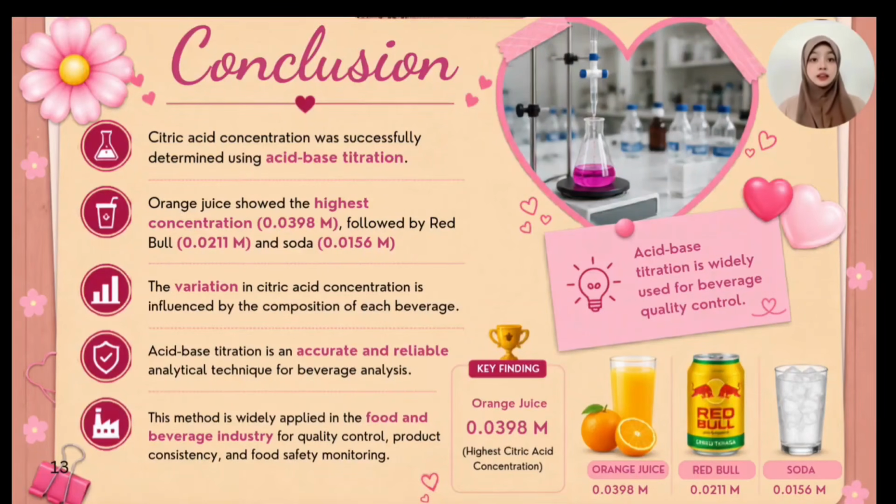Overall, this project highlights the importance of analytical chemistry in everyday life and its role in monitoring the quality of commercial beverages.